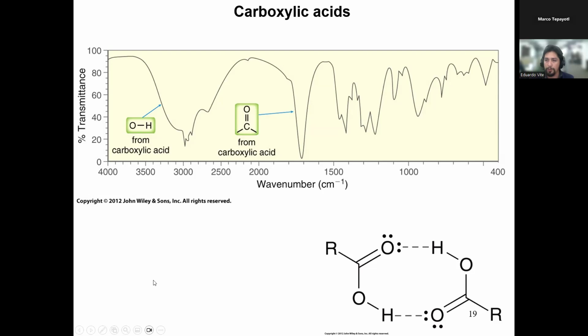And the more you do, the more you get trained at this, the better your eyes become. So every time you see this and you see the beard, right away you're like, carboxylic acid. I know that's carboxylic acid.